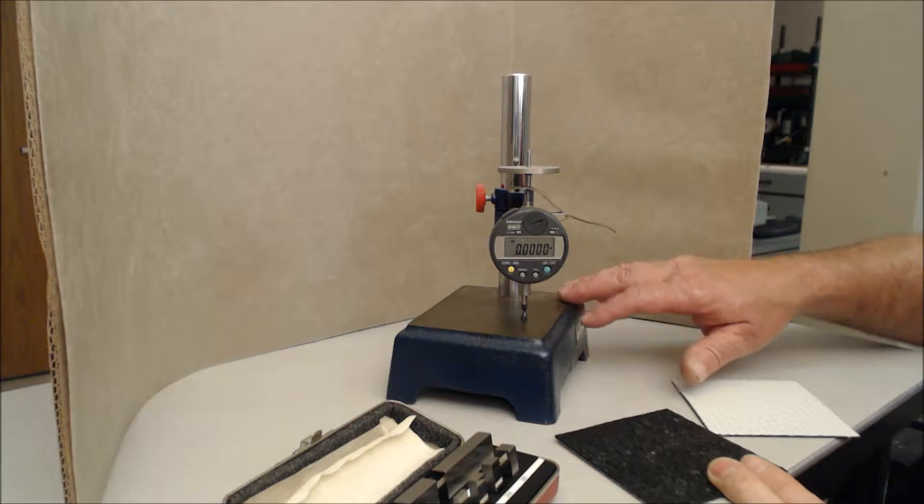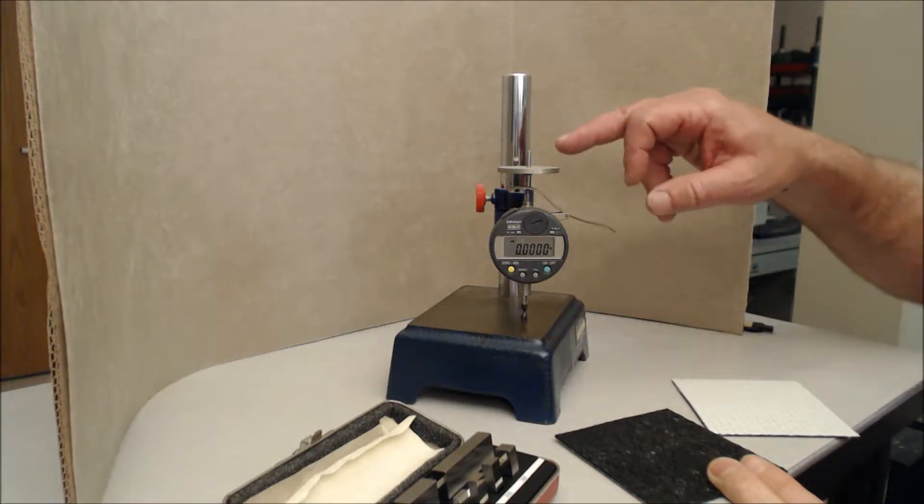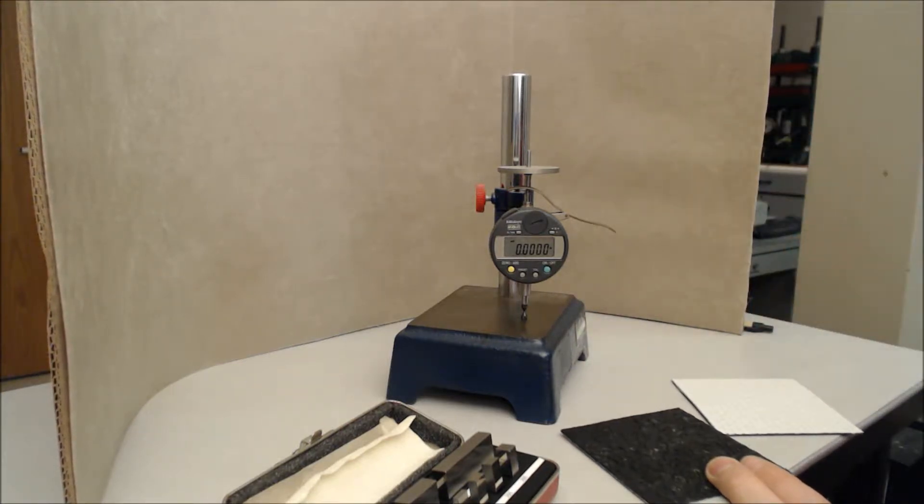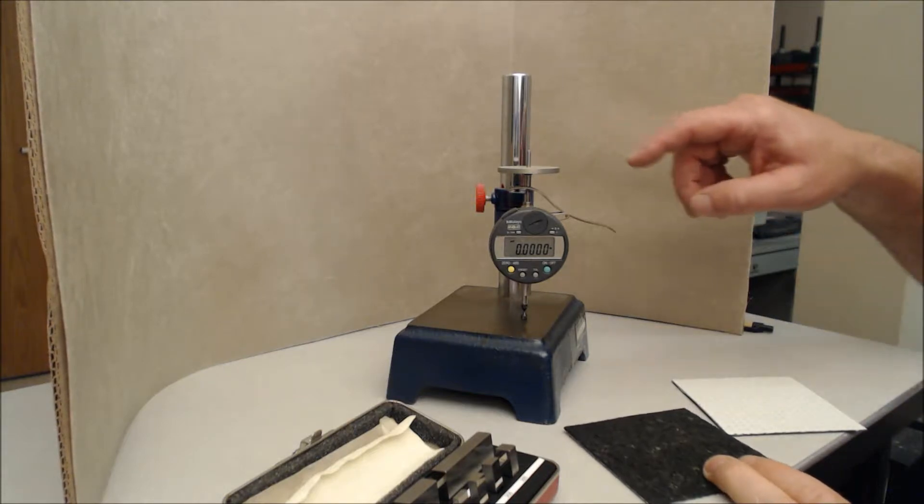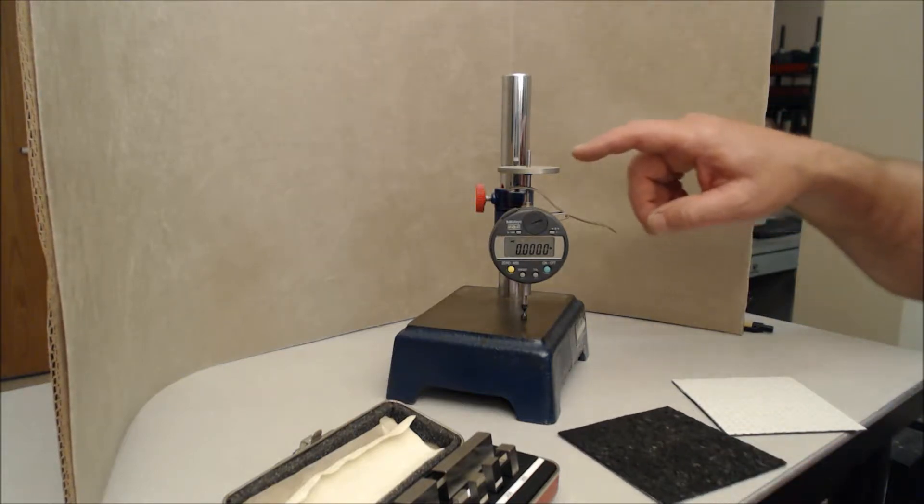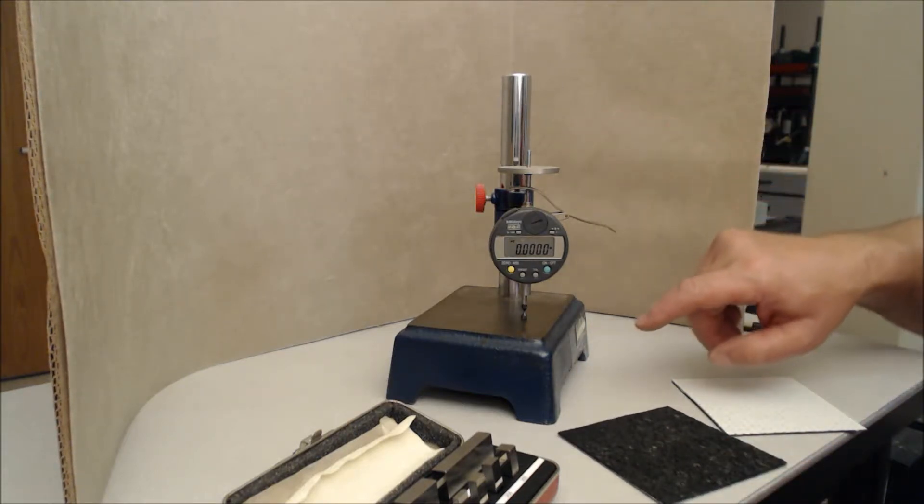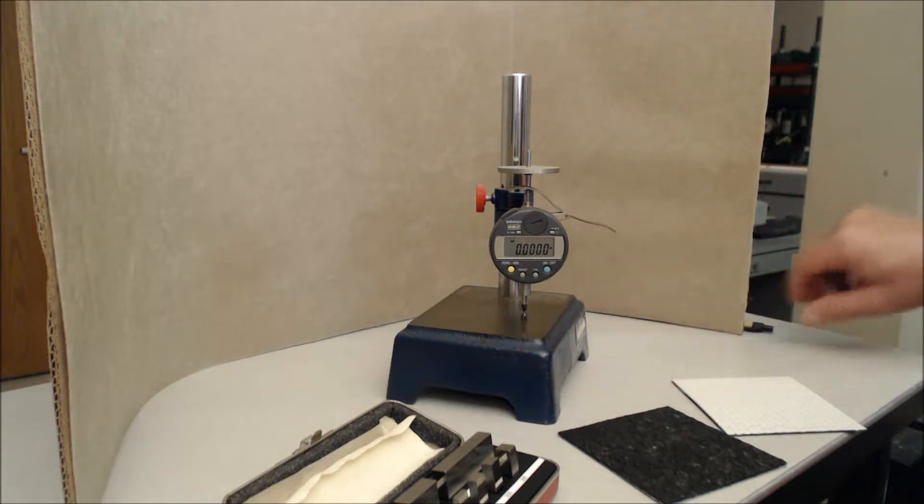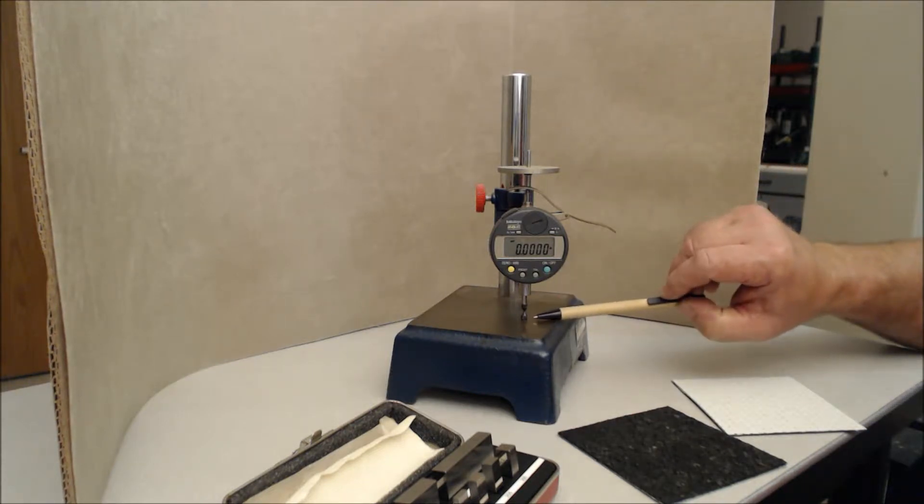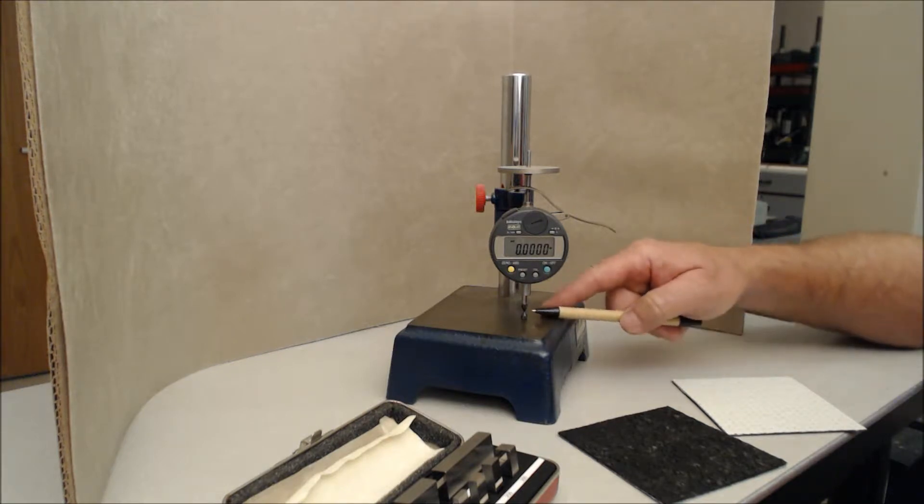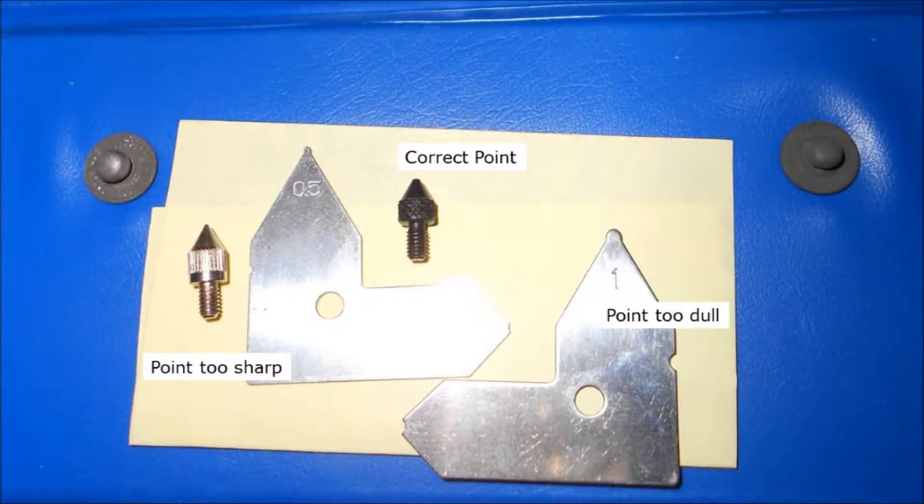This is a deadweight micrometer. It has a normal pressure which is applied by a weight. This is either two ounces or 0.56 newtons that are associated with the pressure being applied. It's being applied to two 60-degree angle conical-shaped tips, and they're located right here. These conical-shaped tips have to meet up.